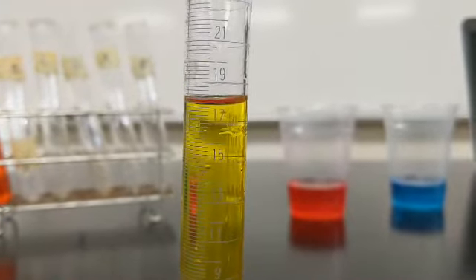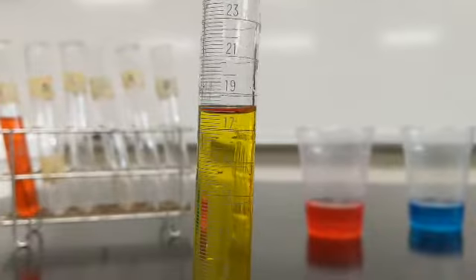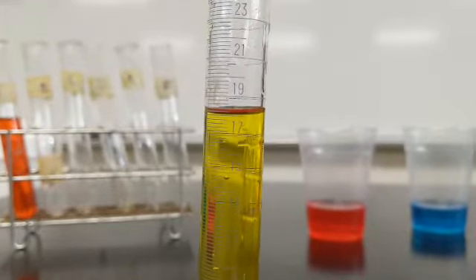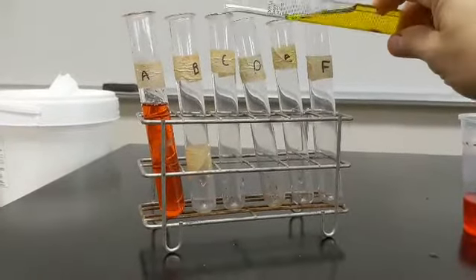Okay, there we go. That's pretty close. Maybe I need to add one more little drop to get that meniscus right on the 18. There it is, right there. Okay, 18 milliliters of yellow. And now we're going to pour this into test tube C.